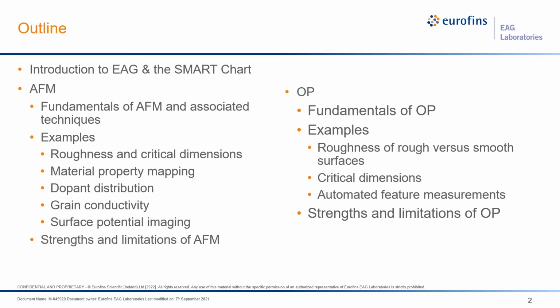The third section of the presentation will focus on OP, how it works, and some interesting applications. Finally, I'll discuss complementary techniques and summarize everything we covered today.